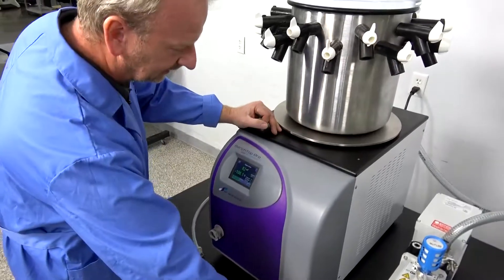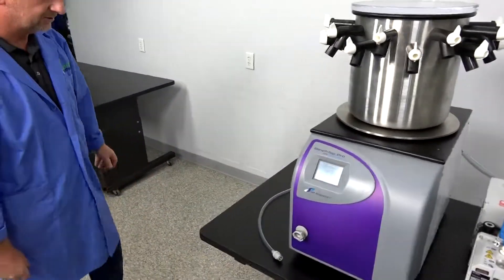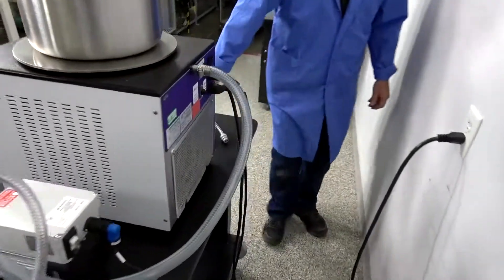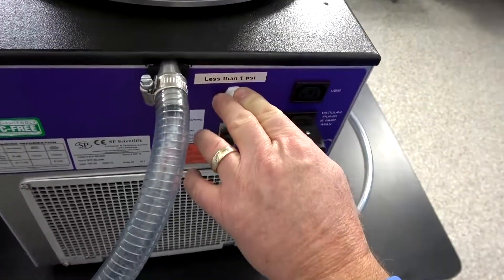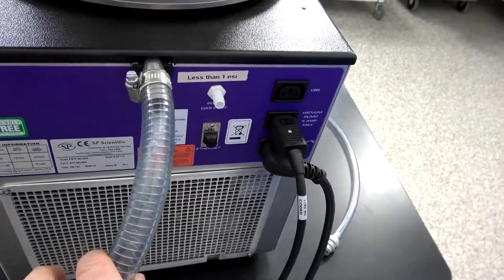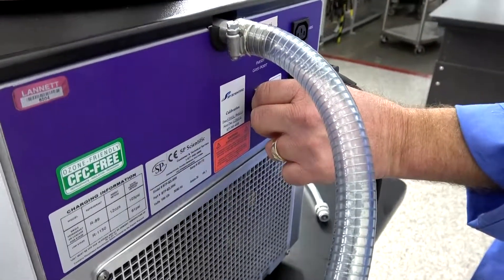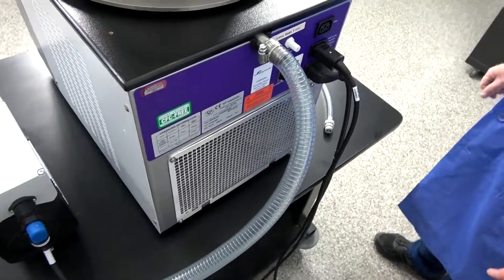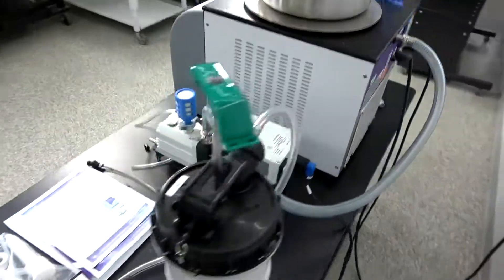I'm going to take you around back real quick and show you it also has the drain port here — plug in and drain — and it also has the inert gas port if you want to utilize that, bringing in some gas other than ambient. Then it has an ethernet connection here, and everything's just in excellent condition. Not a whole lot of use on this system — one of the nicest benchtop models we've had in here so far.